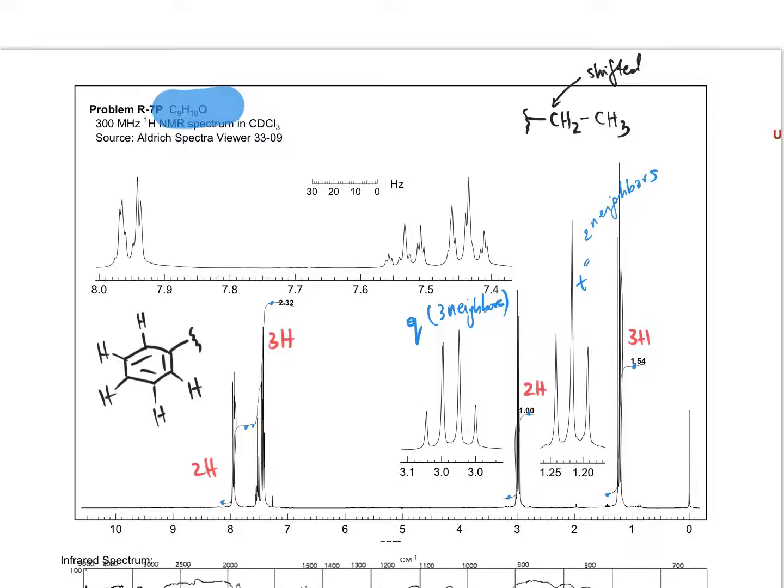So how many carbons have we assigned? That would be 2 plus 6, 8. If you remember from IR, we have this carbonyl in our molecule. That's what we need left, and it looks like it goes in between the 2 fragments. So if you put an ethyl group on one side and an aromatic ring on the other, you got it. But I won't stop here.